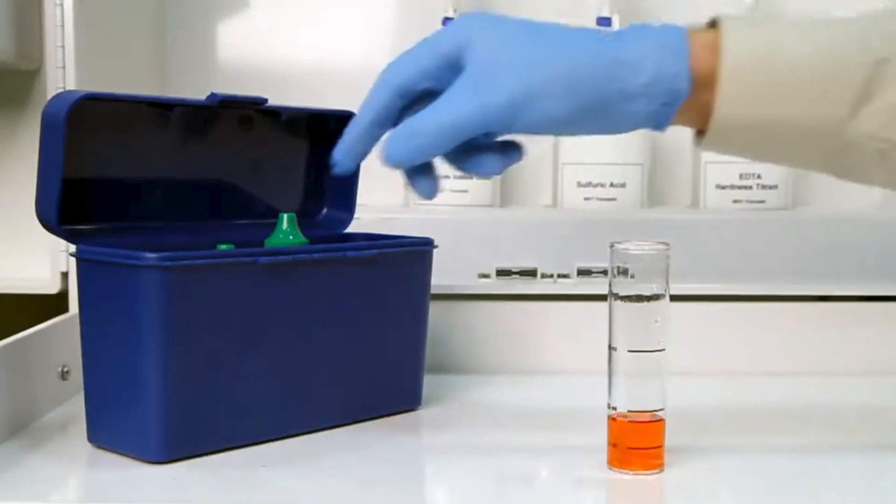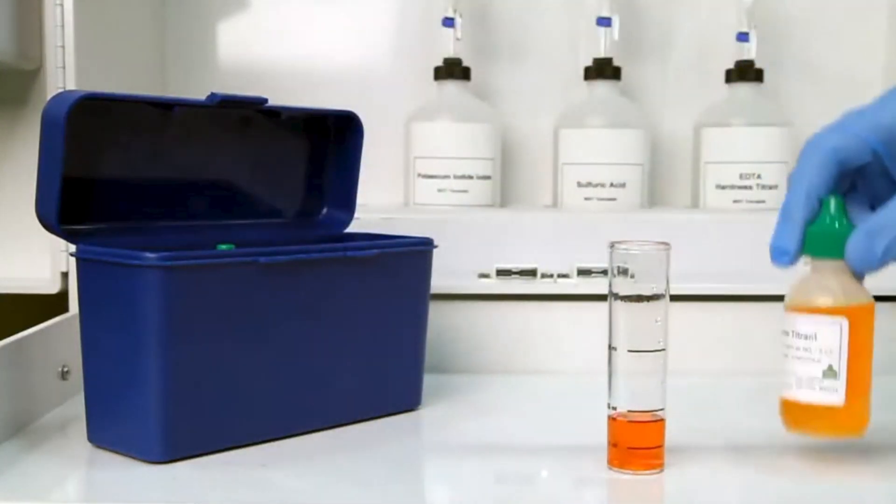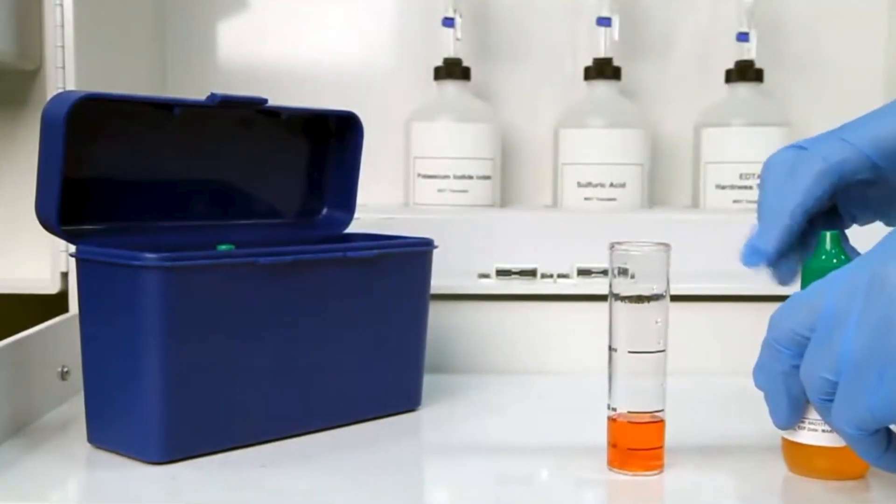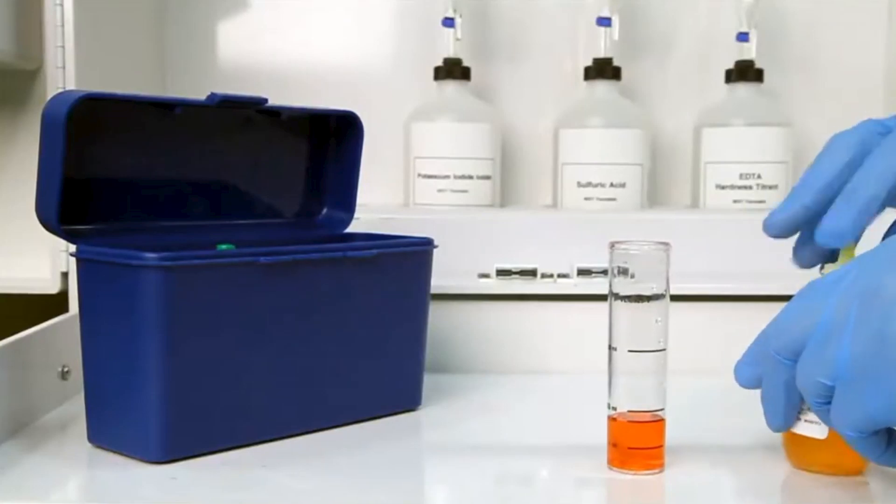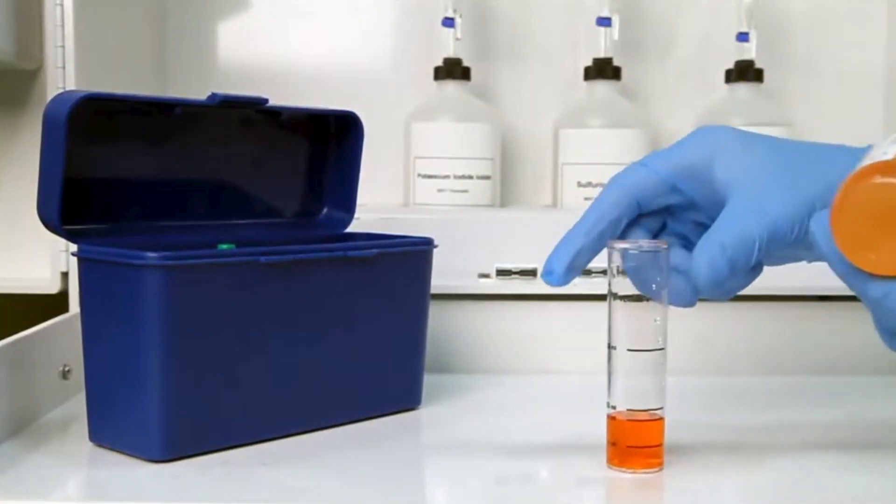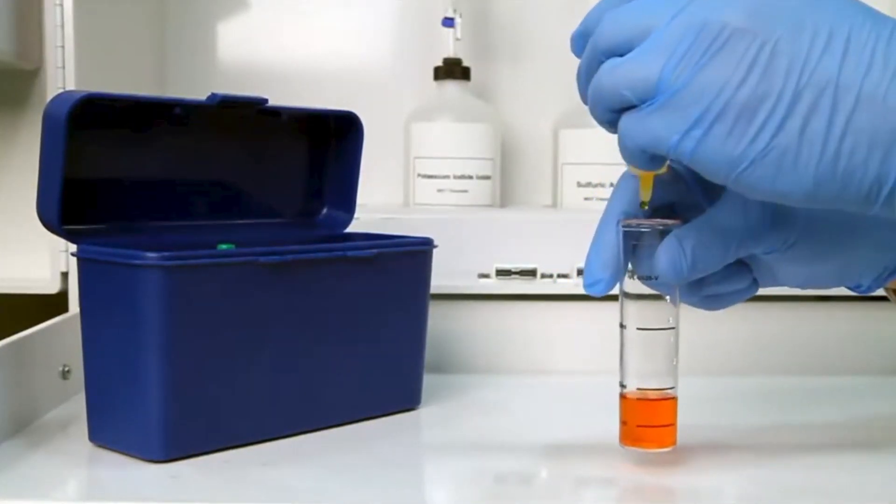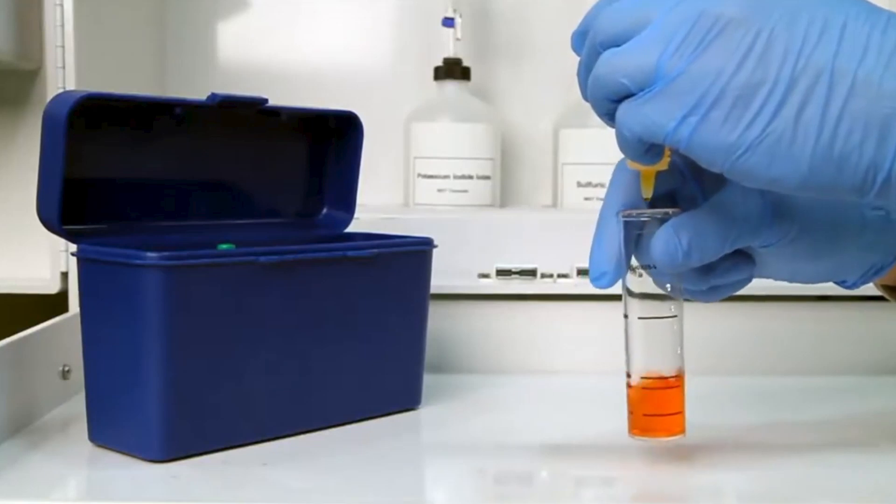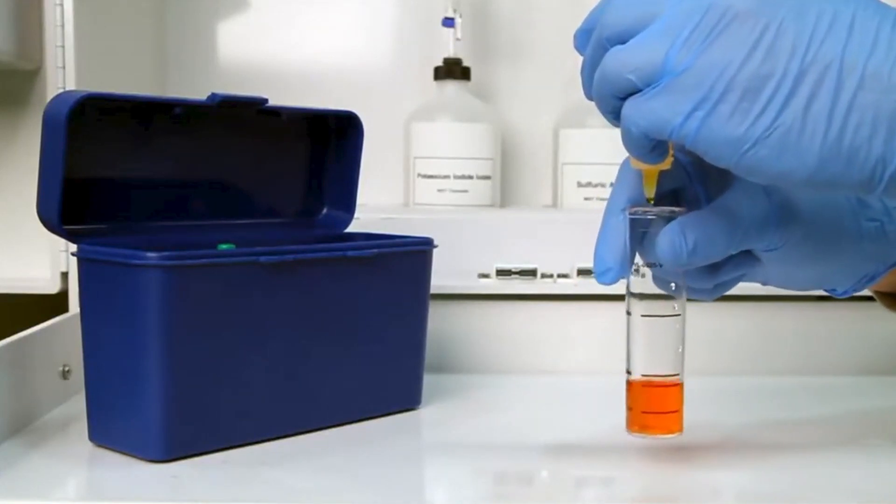The next step according to the EndpointID procedure is to perform the titration. It's important to make sure you have the proper titrant and the proper sample size for this titration. Remember to hold the bottle vertically to make sure you get a consistent drop size.